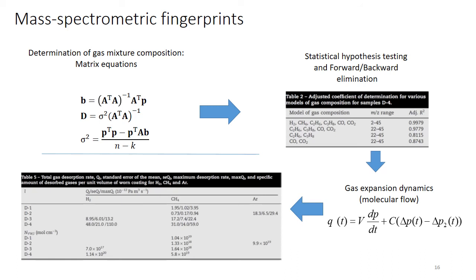So you need to select the model which gives you the best result using the step forward and backward elimination procedure. Then you finally decide which model is the most adequate to your situation. You can quantify and determine the emission rate using the time series of mass spectrometric channels, and the parameters of the system, such as the volume and the conductance of the diaphragm or orifice.